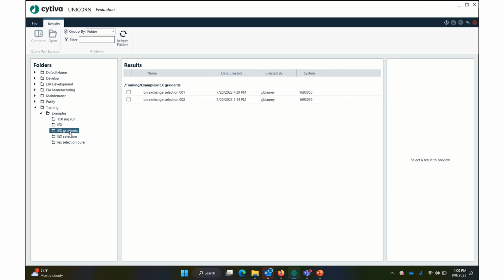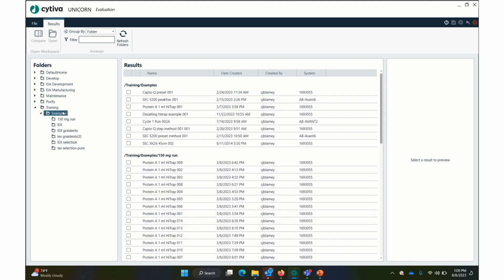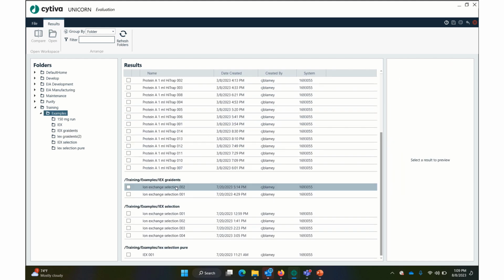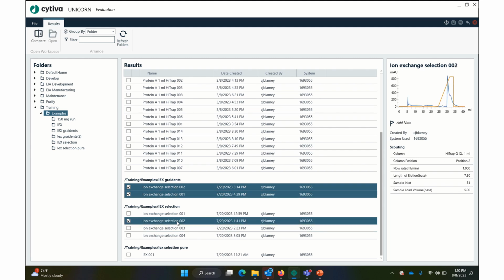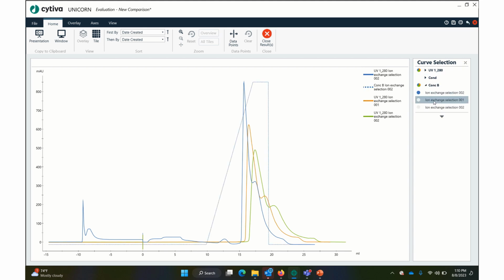So here are the ion exchange gradient runs we just did. I did this one, and we're going to highlight these two. Actually, what I'm going to try to do is hit this examples. Okay, and 2. All right, so all 3. And then compare. Okay, so here we are. I'm going to show concentration B for each of these 3. All right, there we go. This gets a little confusing, so I just wanted to show you each of the different gradients we got. All right, so turn those off.